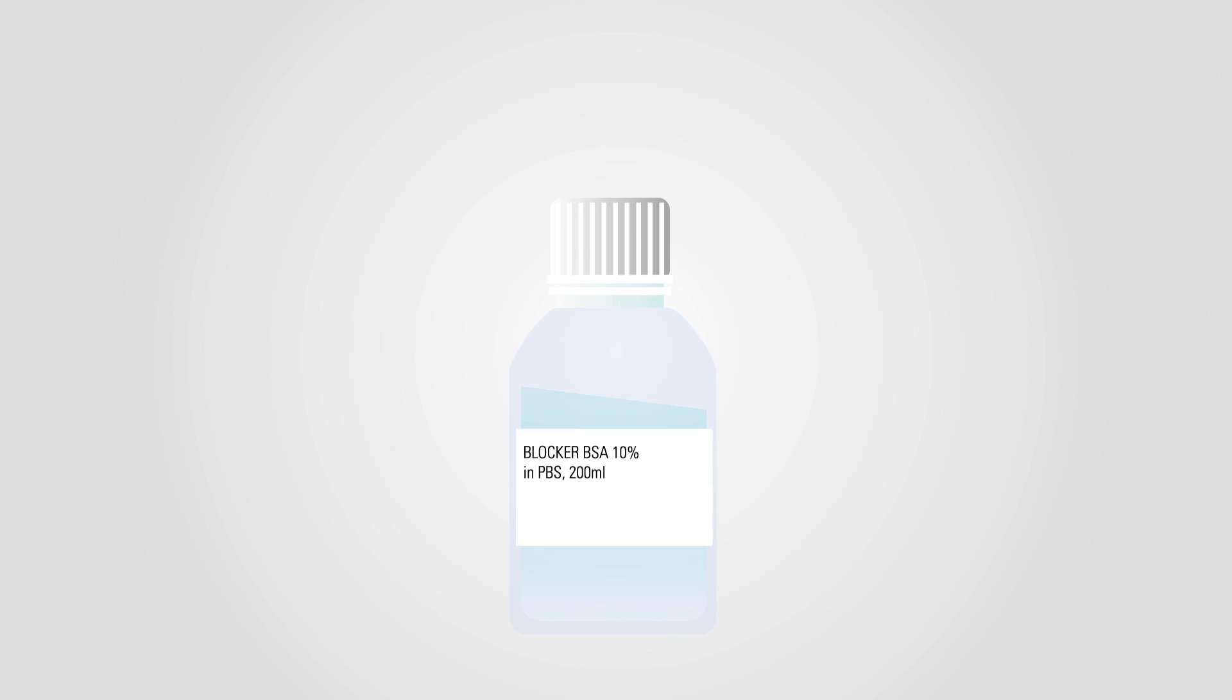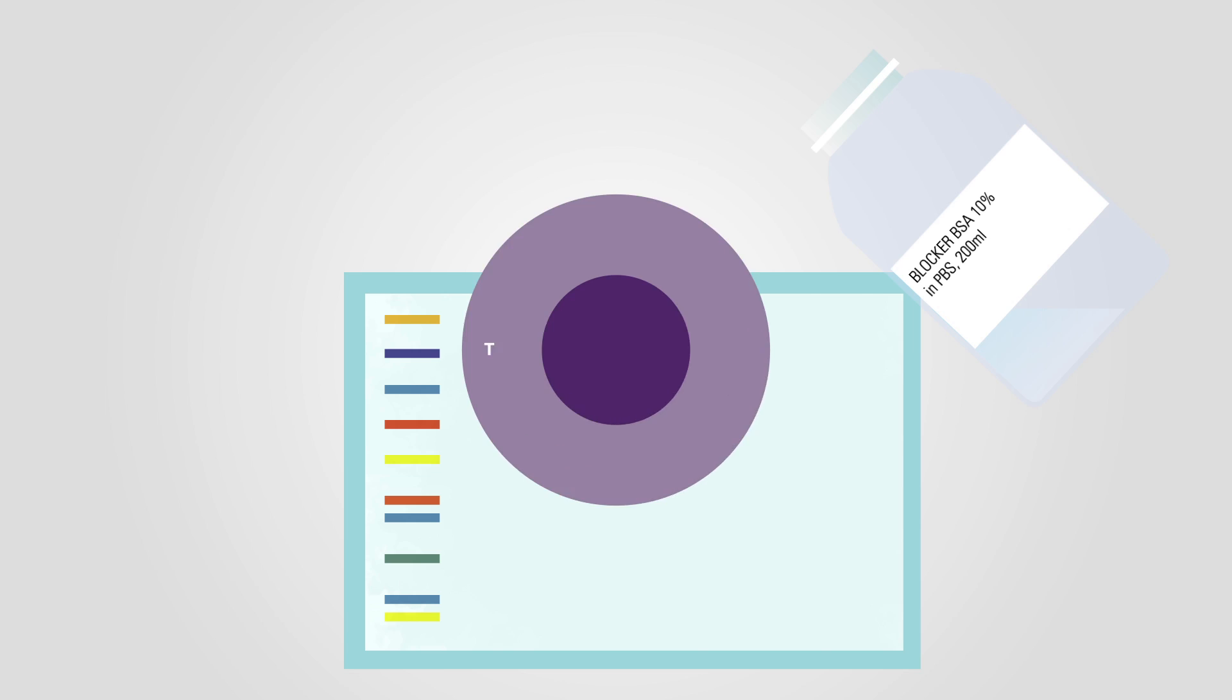Block the membrane in BSA when running a Western blot of phosphorylated proteins. A milk-based blocking buffer is not suited for the Western blot of a phosphorylated protein as it contains casein, a phosphorylated protein, as well as a high level of phosphatases that can cleave the phosphate off of the target protein.